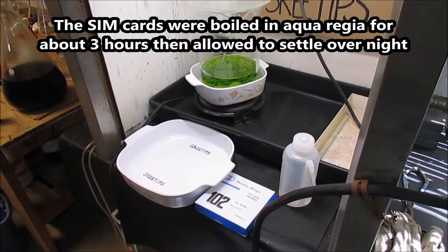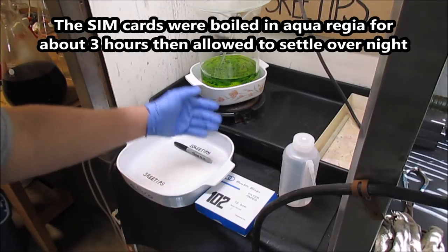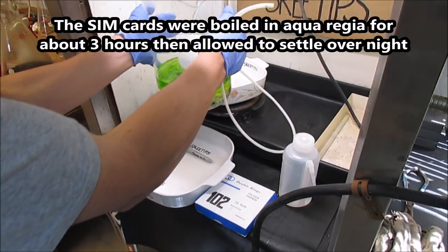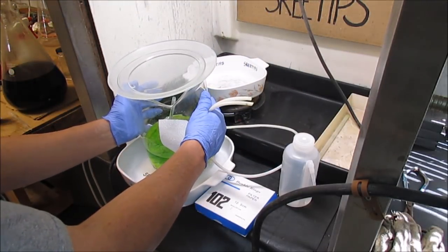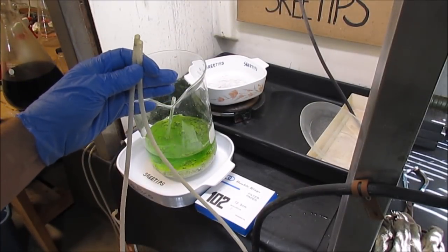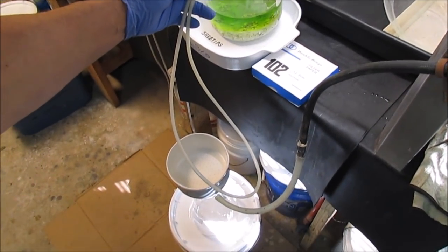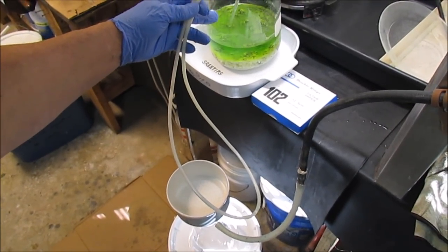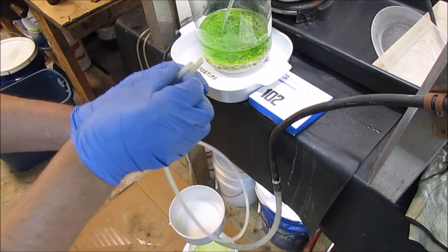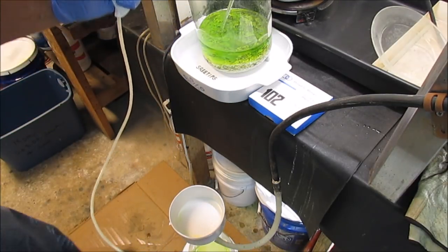Set up to do a filtering here. I'm gonna put a little Sharpie in my dish with the beaker on it so it tilts the beaker towards me. Now what I'll do is I've got a tube here. I'll siphon the solution out of the beaker and down into this filter funnel that I have set up here for vacuum filtration. Okay, I've got a tube full of water here. Put my thumb over one end of it, put the other end down in the beaker, and then let my thumb off in the filter funnel there.